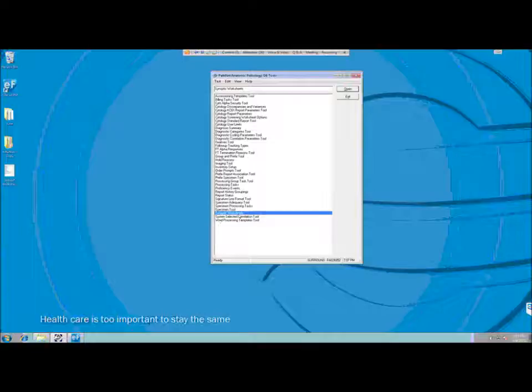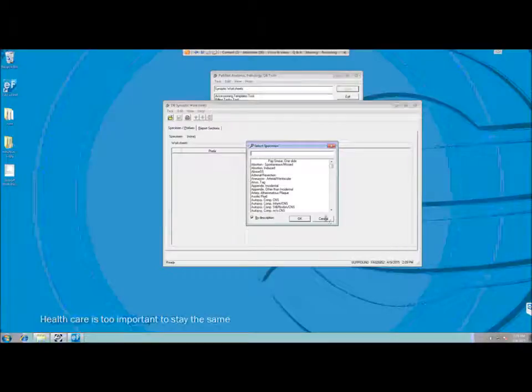So what we have done is we've enhanced the tool so that if it's configured, just by launching the tool, it's going to scan the local mTuitive database and pull in the worksheets from the mTuitive side, and then you can start associating them with specimen and report section. So when I launched the tool, what it basically did is it pulled in the worksheets that I had deployed on the mTuitive administrative tool, and now I can start associating those worksheets with a specimen and report section.